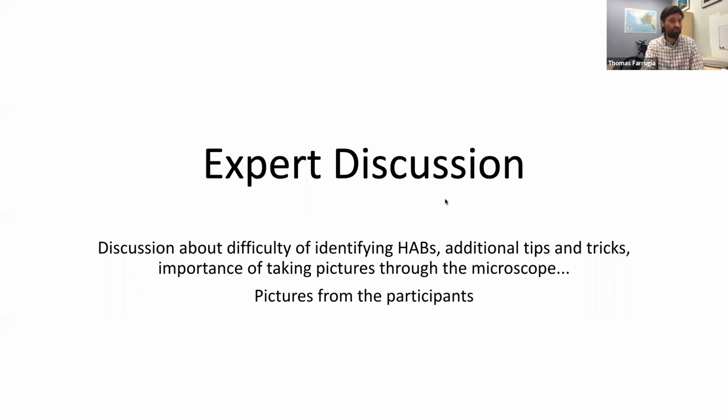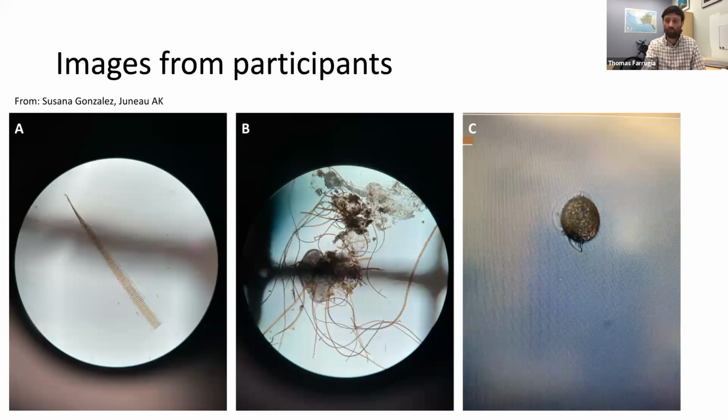Okay, I think we should probably move on just because we want to make sure we have a little bit of time for the sampling. I'll just touch on a couple more quick things. Let me just share this again. If we don't have any quick answers from the panel of experts, we shouldn't spend too much time on it. But we did get a few images from participants that I just wanted to touch on real quick.